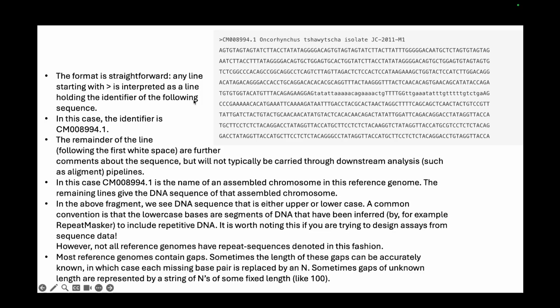So I'll go into the detail of each line, what it means, what these different formats mean. But from the second line, if you ignore the first line for a moment, what you see is basically the stretch of ATGC, ATGC. Now you'll notice some ATGC are small in letter, some are capital, and if you look very carefully, I cannot find it, but there will be certain N's as well. As I was saying, if the base caller is not confident what base that is, it'll put an N. So it's a very straightforward format.